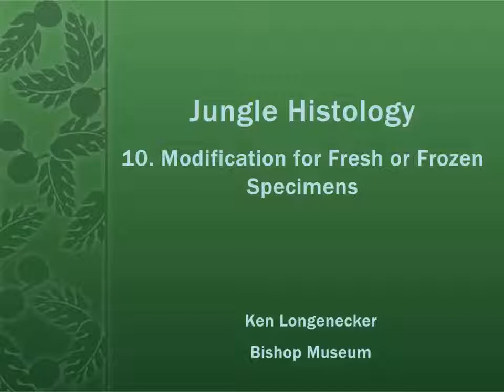My name is Ken Longenecker, and this 10th module is designed to supplement the 9 modules you've already watched, where I showed you the methods my colleagues and I use to perform rapid reproductive analysis on coral reef fishes. For those other 9 modules, I've assumed you'll be working in an environment where you can't immediately process fresh specimens, or you don't have the ability to freeze specimens as they're collected.